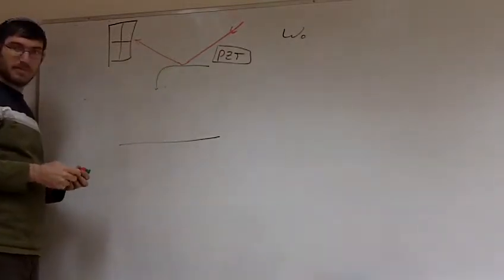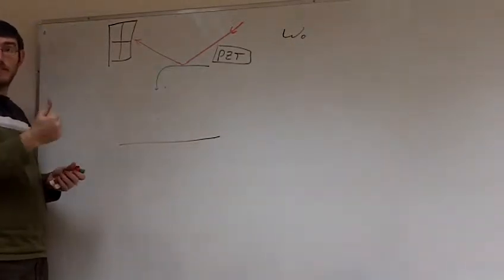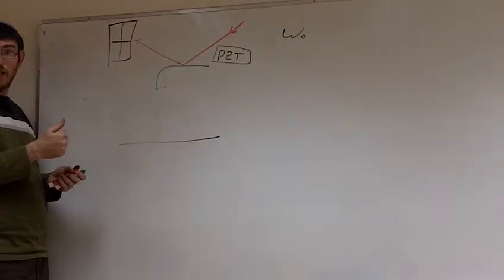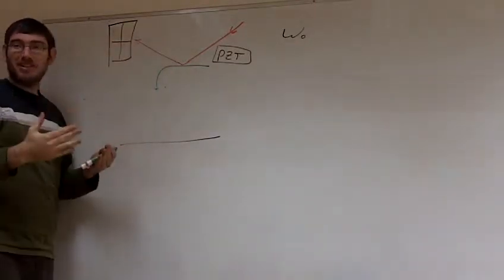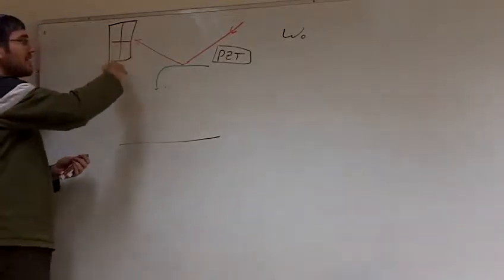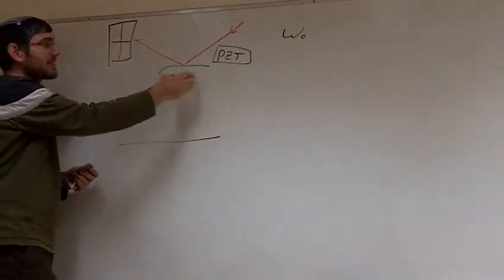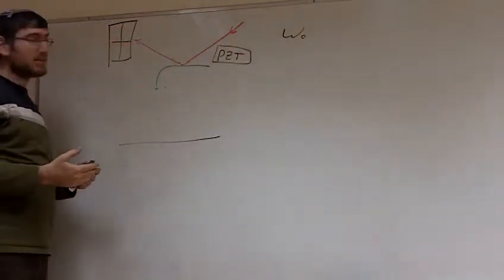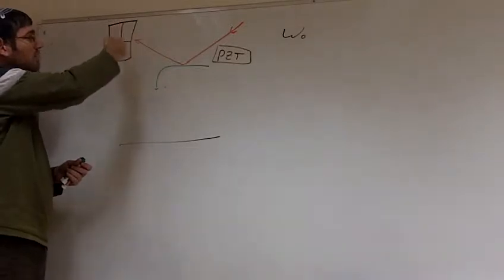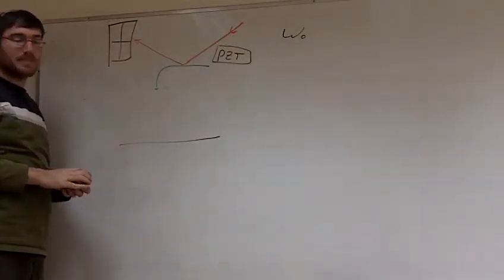Okay, so this detector output is AC output. Yes, it could also be DC for the contact mode, because in the contact mode, the motion is fairly slow. The change is fairly slow. Or it can be AC mode, because mostly when we oscillate, this frequency is a couple of tens of kilohertz. So we're monitoring an AC signal at a couple tens of kilohertz.